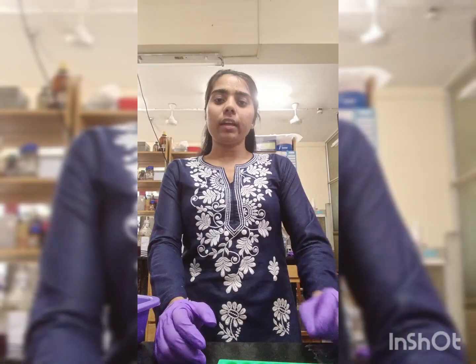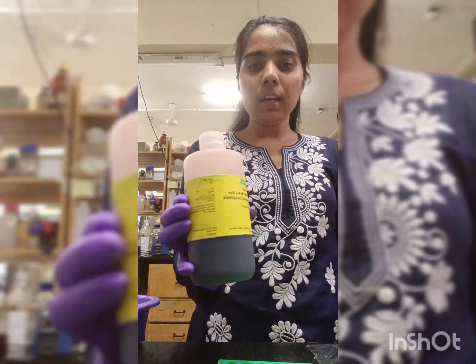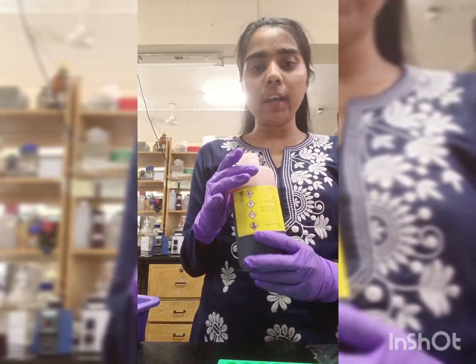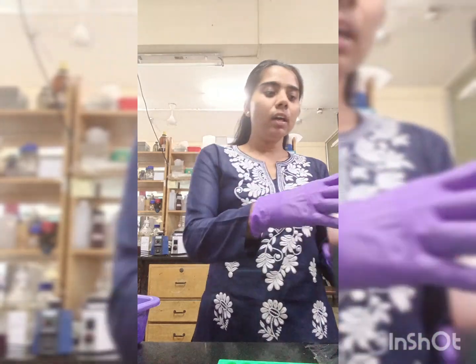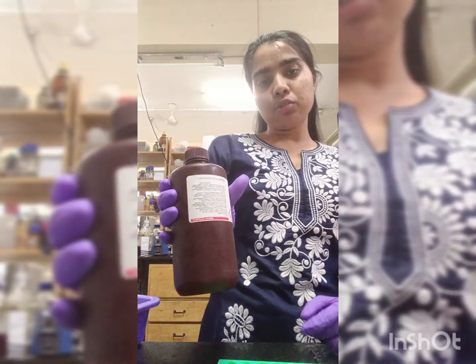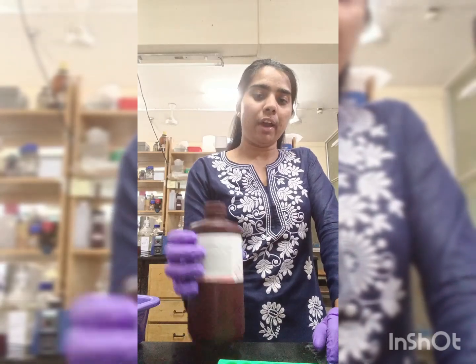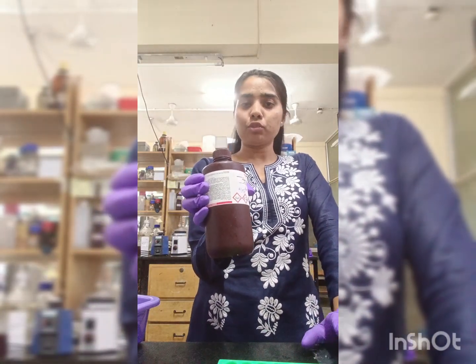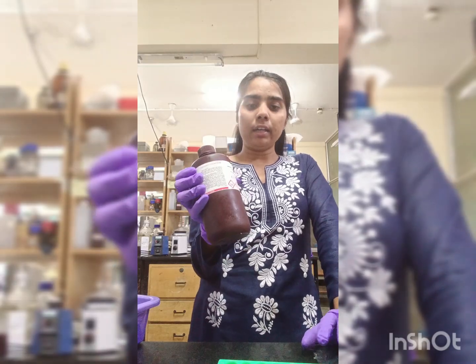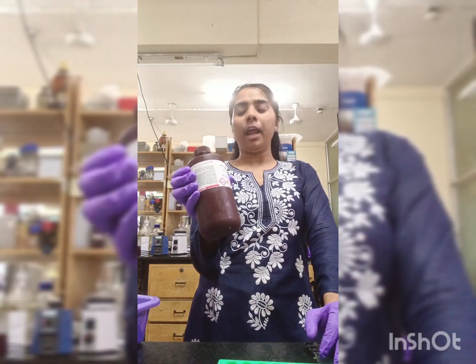In industry, two kinds of Bradford reagent are available. One is this one, the non-diluted Bradford. And in our lab, we use the diluted one, at a 1:5 ratio, like a 5x diluted Bradford.